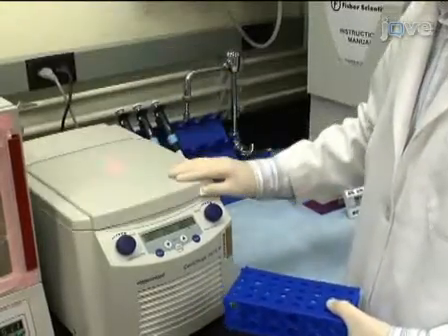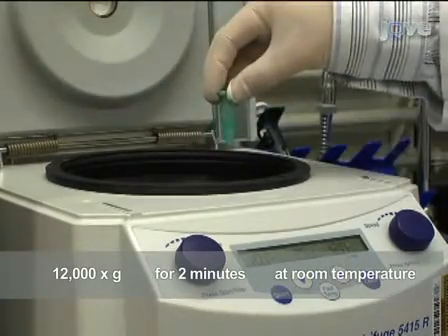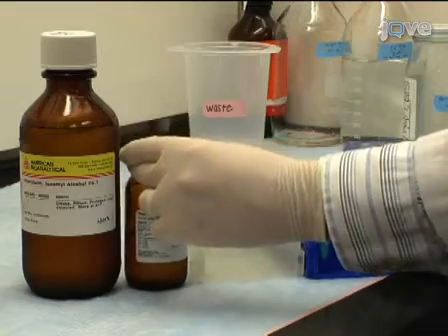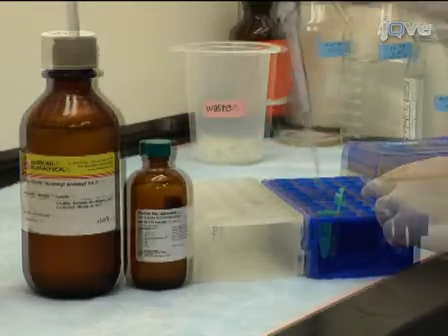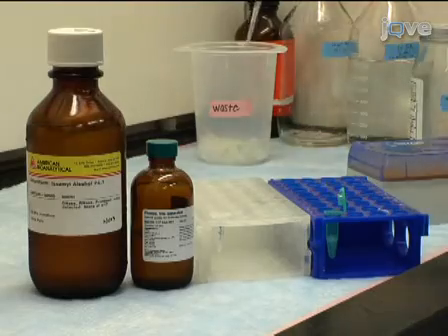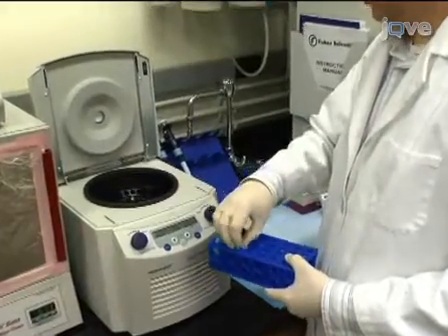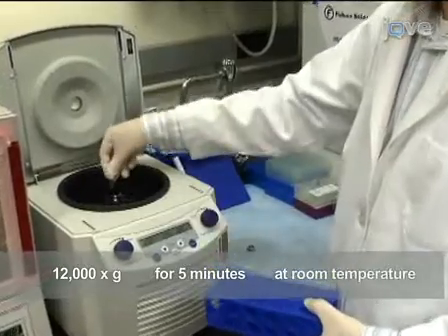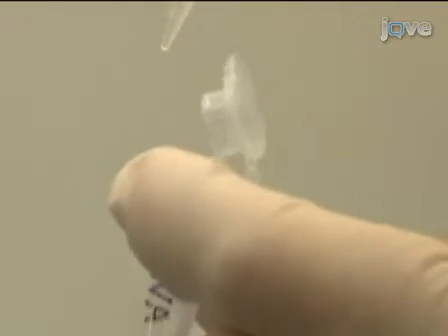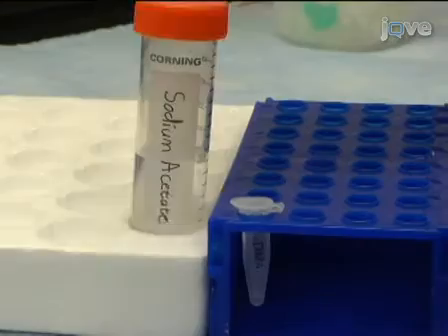To isolate the cDNA product, prepare a 1.5 milliliter phase-lock gel tube by centrifugation at 12,000 g for 2 minutes. All of the gel should be at the bottom of the tube. Add 81.5 microliters of tris-saturated phenol buffered to pH 8.0, 81.5 microliters of 24-to-1 chloroform-isoamyl alcohol, and the sample into the phase-lock gel tube. Mix several times by gentle inversion. Centrifuge the sample at 12,000 g for 5 minutes at room temperature. The cDNA should be in the upper aqueous phase. Transfer the upper phase, which should be about 20 microliters, into a clean 1.5 milliliter microfuge tube.